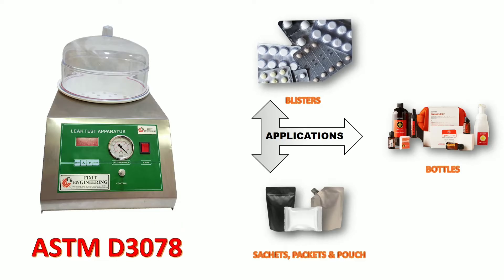It is used to check sealing integrity of medical devices and blisters, bottles, sachets, packets and pouches.